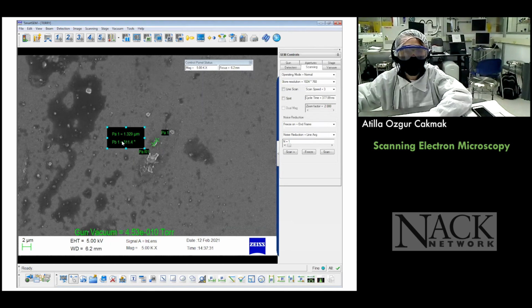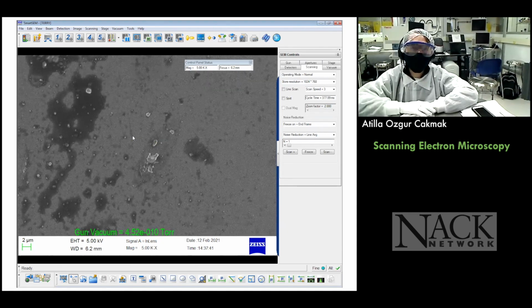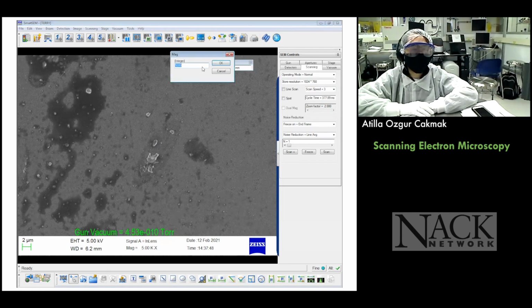Great, great, great. So what do we see? We see that these are not nano yet. These are micron, right? So let's delete this. Now, I will ask you to go to the magnification box again, and let's now enter something more. Something like 50K, 50,000. We can just enter one more zero, or just enter it all together.